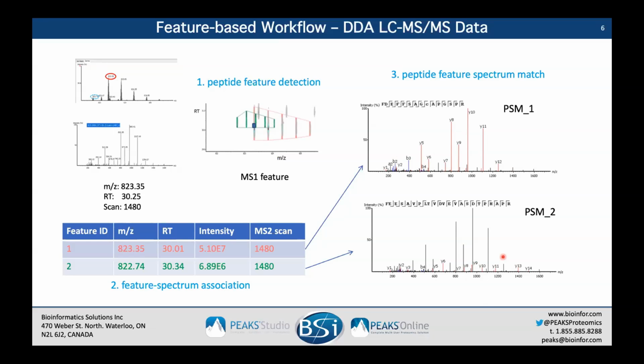And so this is really helpful. I mean, when you have a busy experiment, or you have multiple scans coming off at the same time, this can really help in terms of the identifications, as well as the quantifications of these.